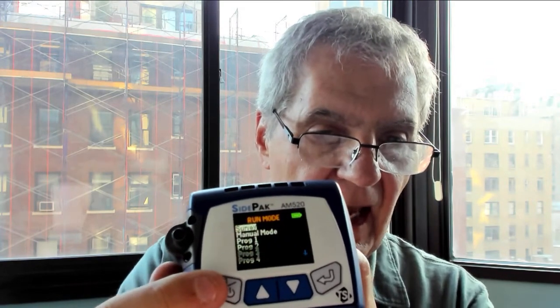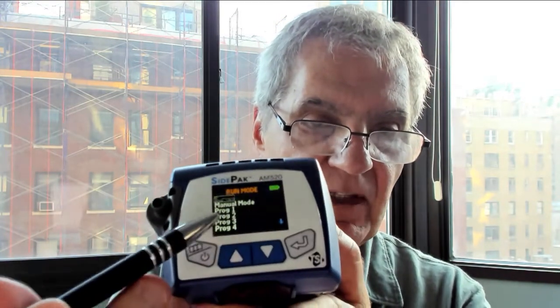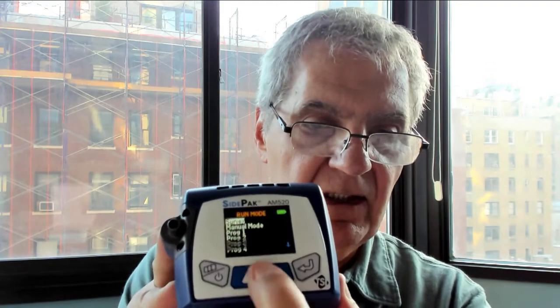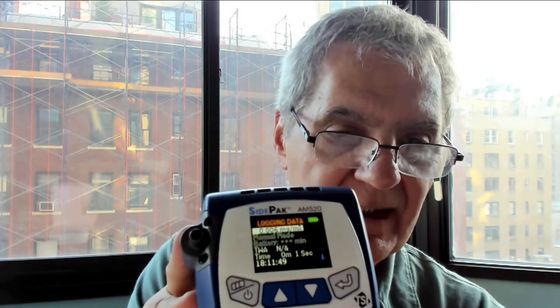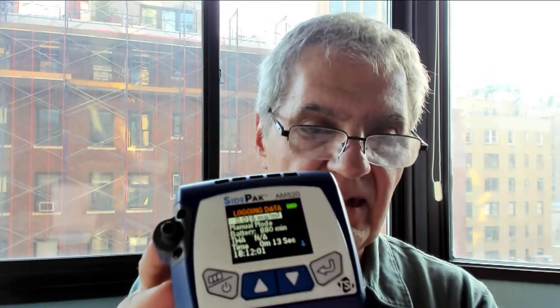The important thing is: if you want to record your numbers you have to scroll down to manual mode. Right now it's on survey mode. To record your data, go down to manual mode, hit return, and now you are logging data. Too many students have turned it on and forgot to start logging. The time has been set on the computer, so it's synchronized — right now it's about 6:11 p.m.